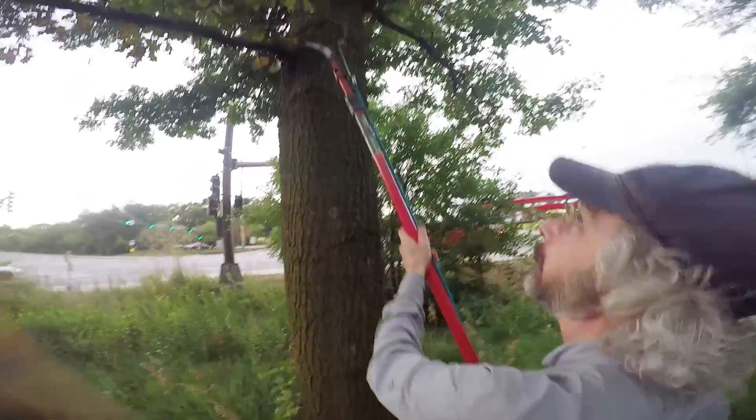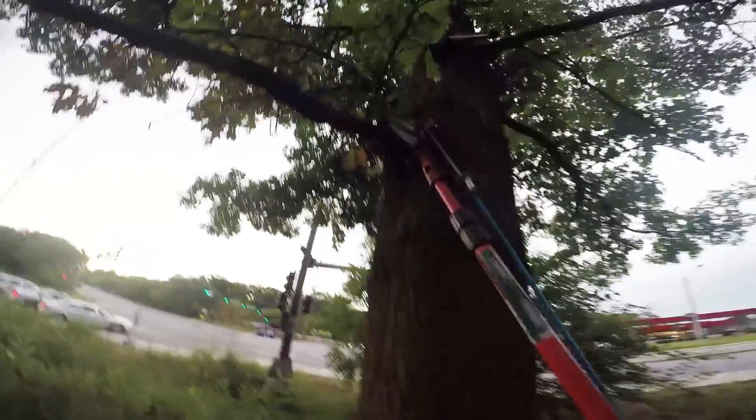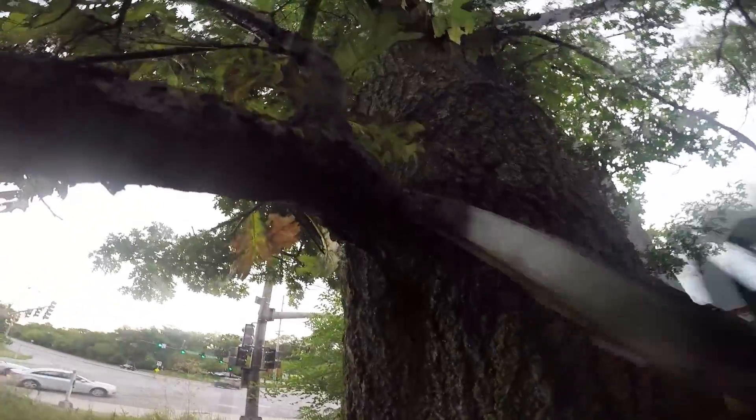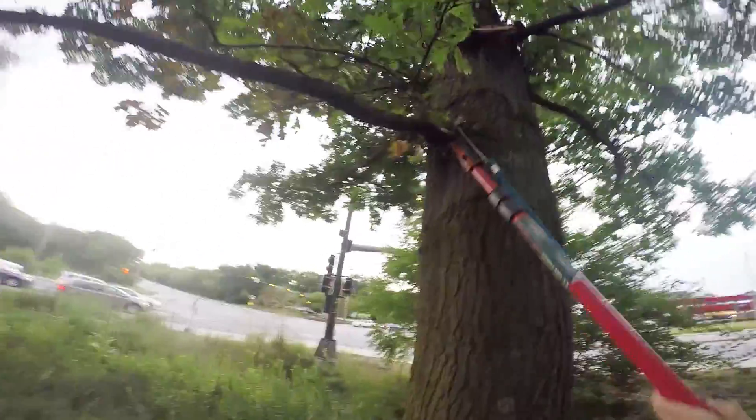Approach your tree and select a living symptomatic branch. This means that you want the branch you're going to cut to have some green tissue. Completely dead branches are not good for testing.